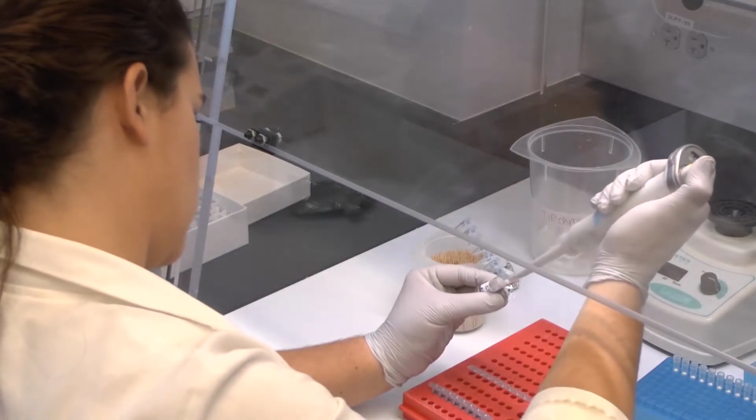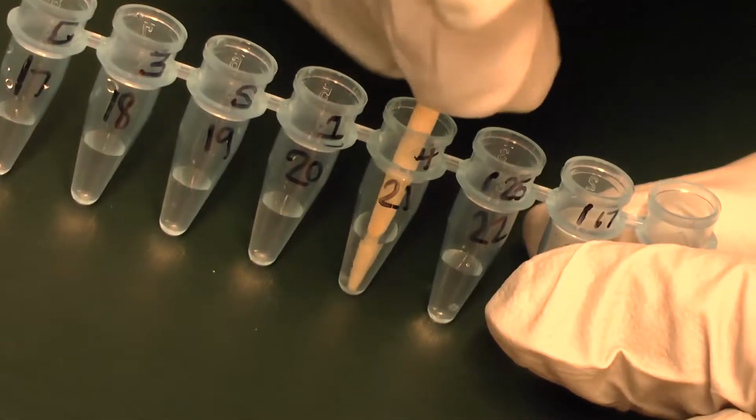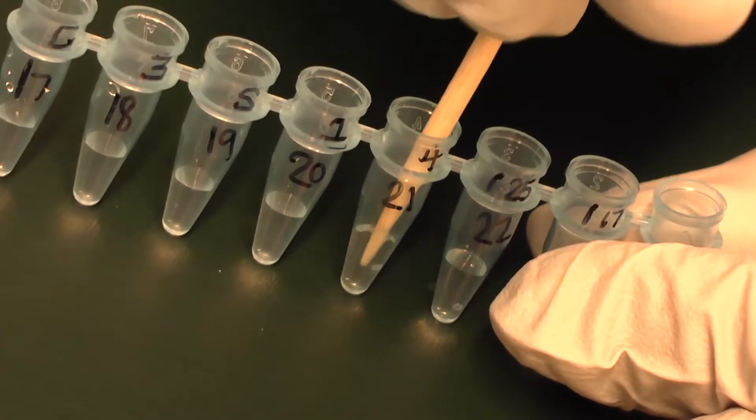Dr. Peebles and his research students go out on a ship into the Gulf of Mexico and they collect all of the free-floating fish eggs at a given site using a plankton net. We then take these fish eggs and we extract the DNA from them. Every organism contains DNA that's unique to that organism. By extracting the DNA from the individual fish eggs, we then amplify a barcoding gene. So you can think of this just like the barcode on an item at your supermarket. When we sequence this gene, we can then compare it against a database, and that tells us what species each fish egg belongs to.